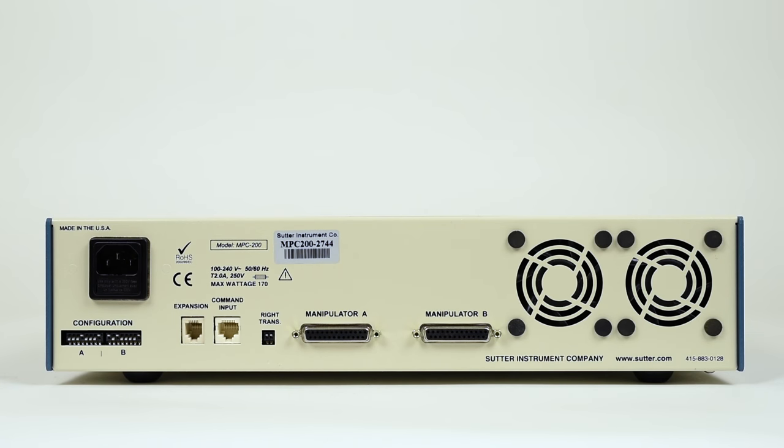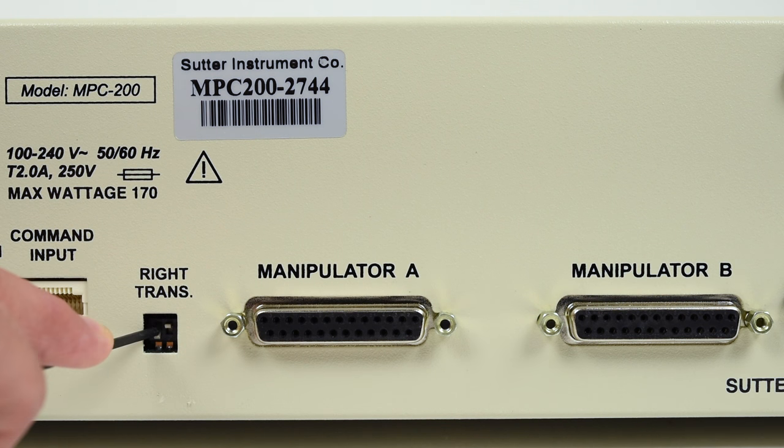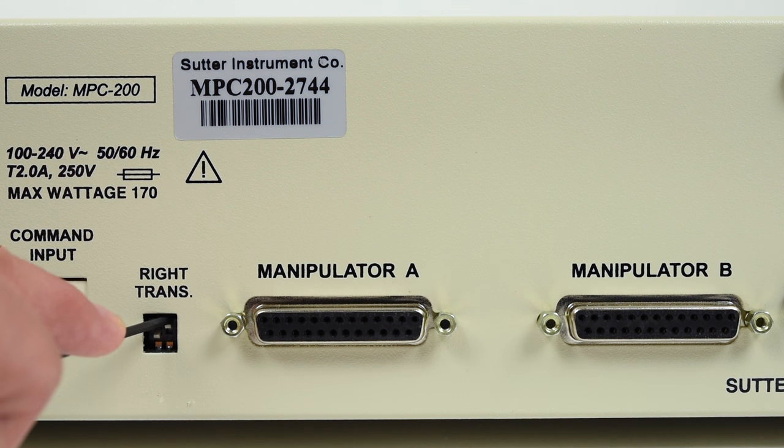On the back of the main controller box, you will find two DIP switches labeled right trans that you need to flip when you are using the right angle adapter. When adding the right angle adapter to a manipulator on port A, change the position of the left side switch. When adding the right angle adapter to a manipulator connected to port B, change the position of the switch on the right.